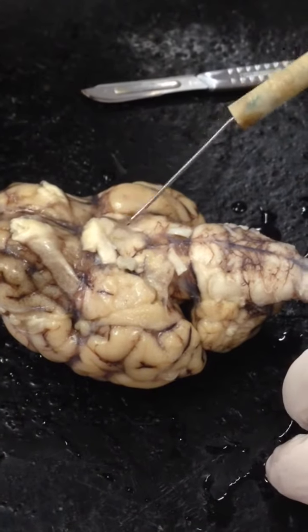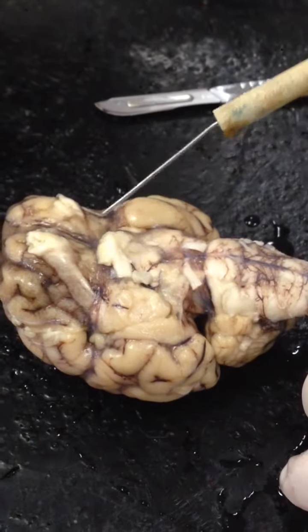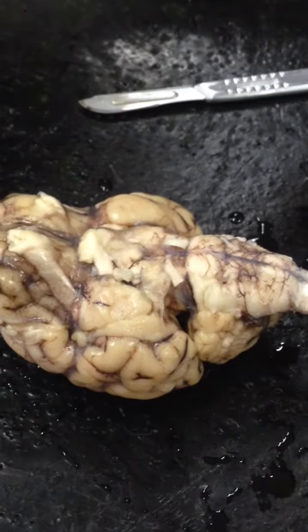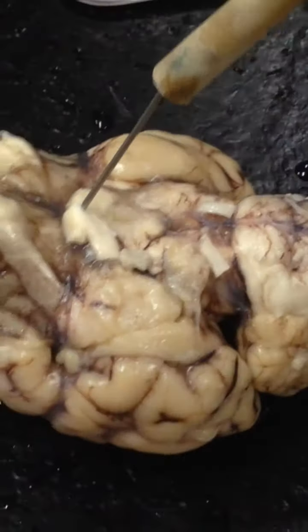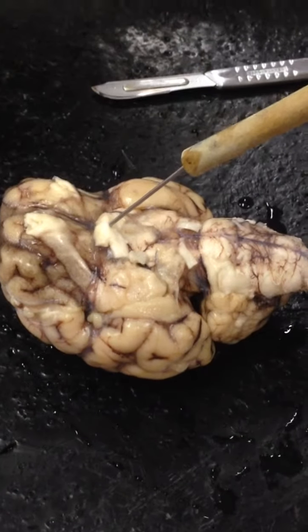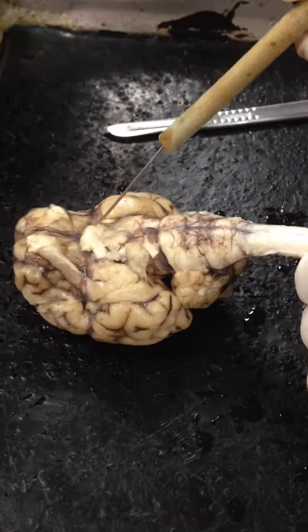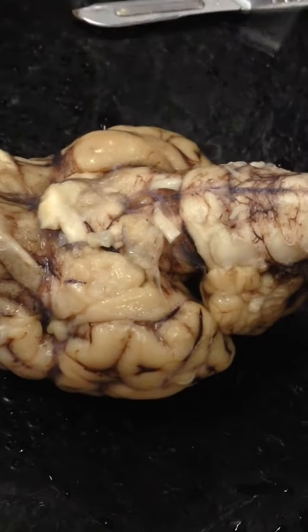Remember when I was talking about the X on the board? So the X would be here, okay? Your optic nerves would come up here, but they've been cut off as well. This is what happens when we get them. It's already gone, okay? The middle of the X, if I were to put the dot right there, a pointer, that's your optic chiasm, okay? The tracts going downwards from the optic chiasm are your optic tracts, okay?